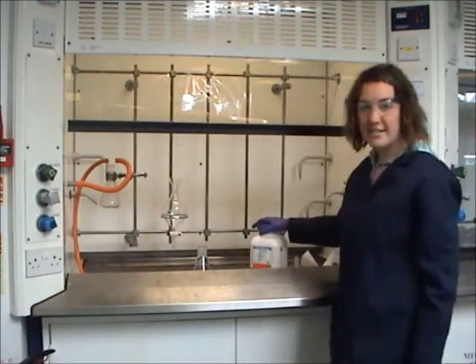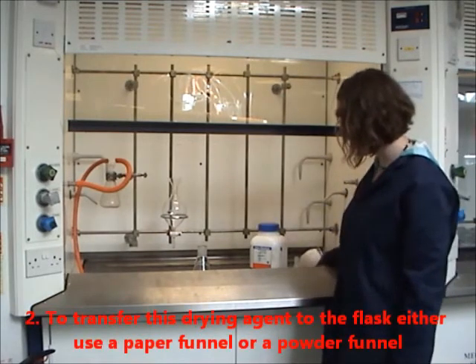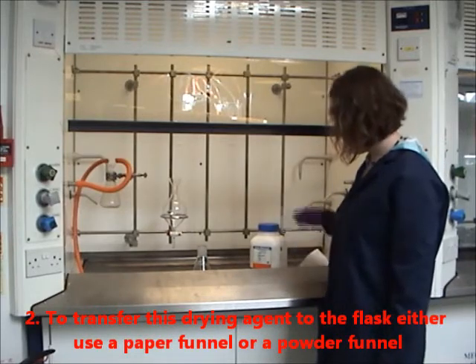There are many different types of drying reagents. Today we're going to use magnesium sulfate. To transfer the drying reagent into the flask, either use a paper funnel or a powder funnel.